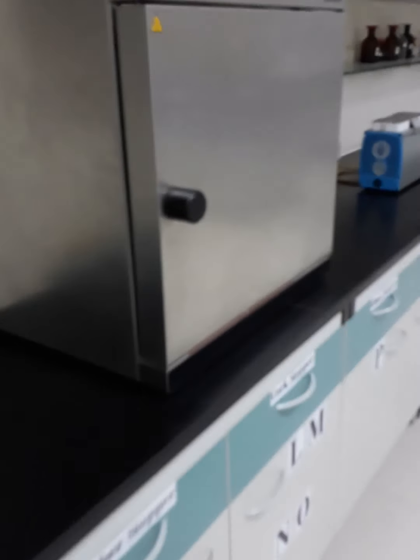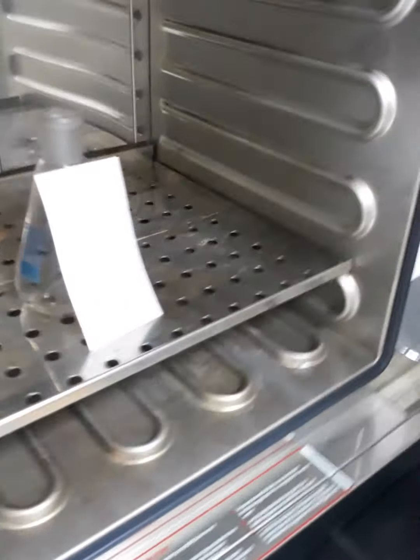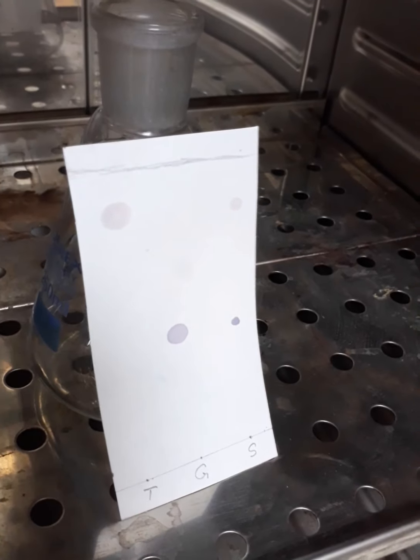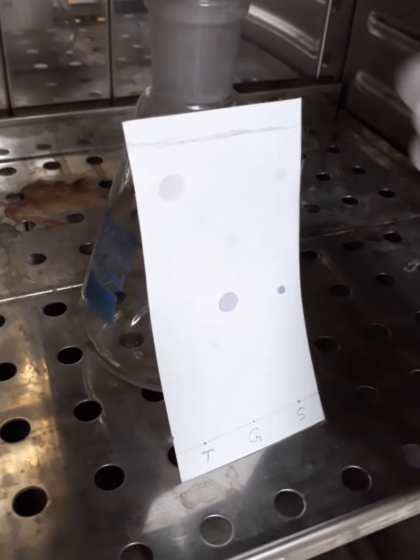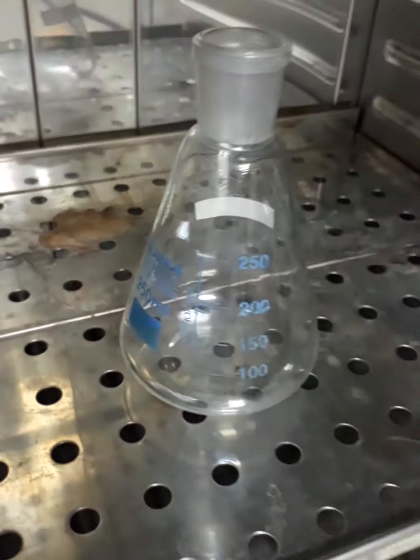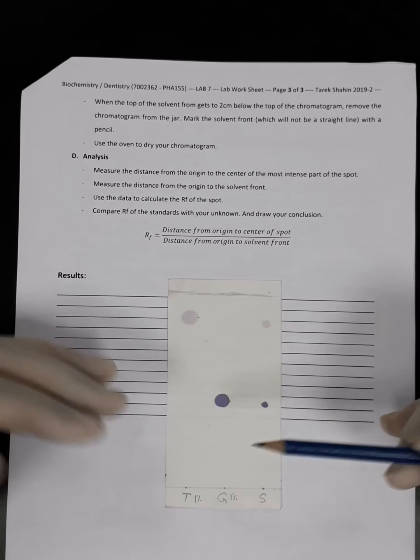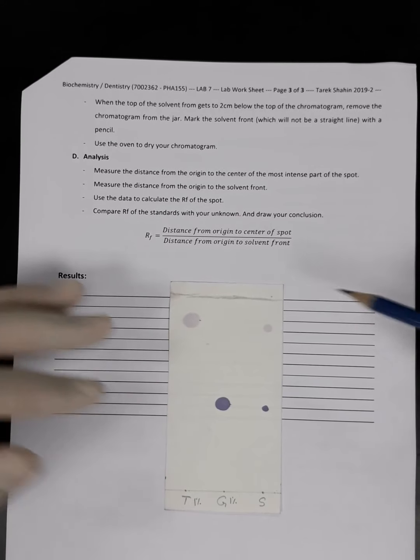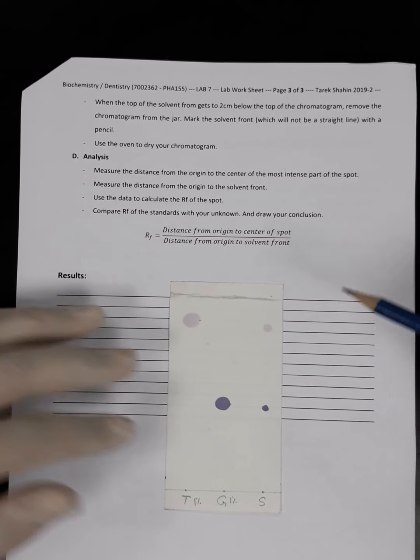Now we are going to remove the chromatographic paper after the heating. So now we can see the spots start to appear on the chromatographic paper, or the chromatogram. Now we are going to take it and start the analysis. Okay, so this is the result we got after the ninhydrin application, which is the chromogen, and now we are going to understand what is the meaning of these colors.